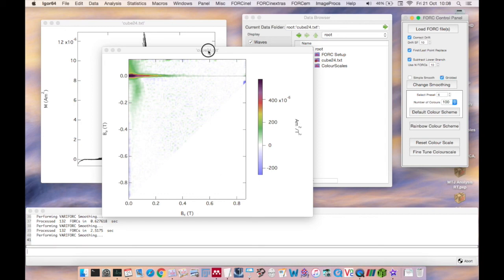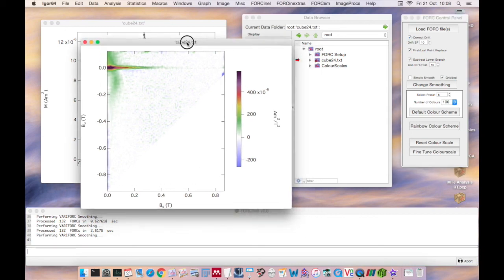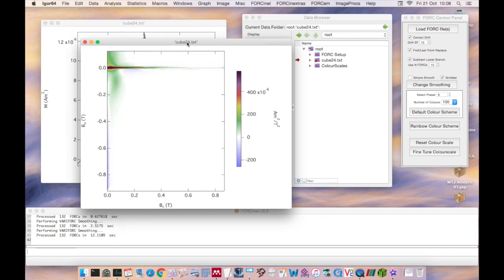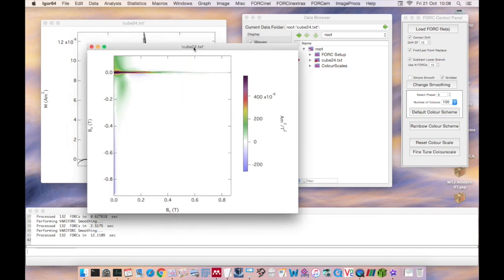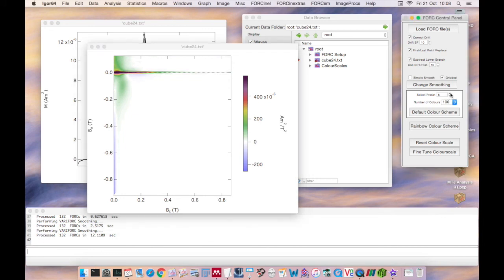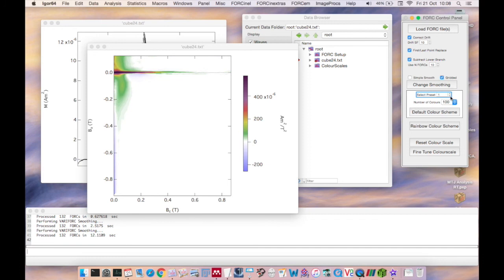So now you can explore different smoothing factors by clicking the change smoothing button, you can optimize the display parameters for your processed fork diagram. More detailed descriptions of how to do that can be found in the separate videos that you'll find on the nano paleomagnetism website. Thank you very much.